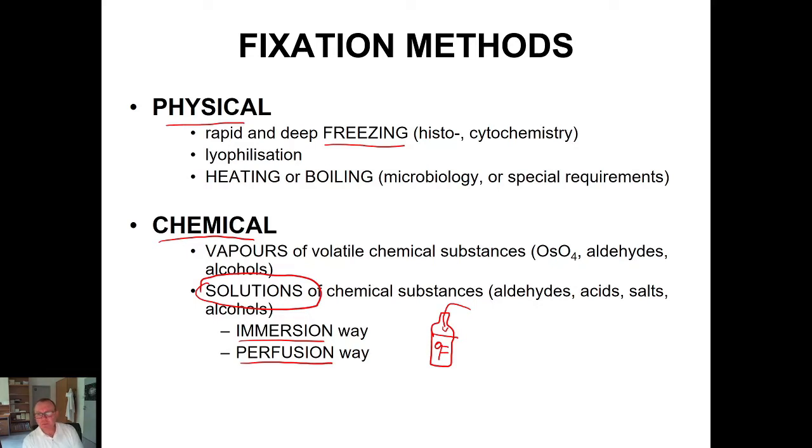The fixative solution slowly penetrates the tissue by its own vessels and is diffusing through the capillary wall directly into the tissue. Capillaries are almost everywhere, and so the whole tissue is fixed in one moment.